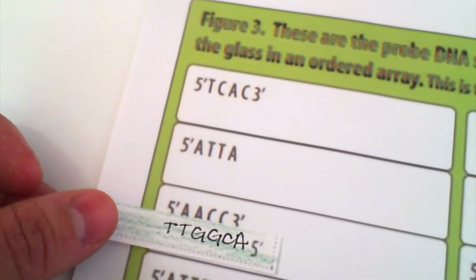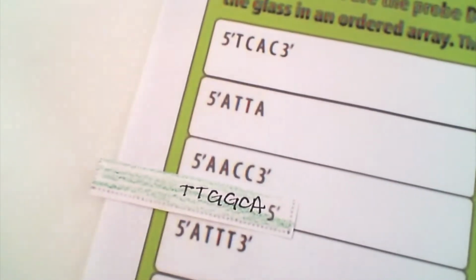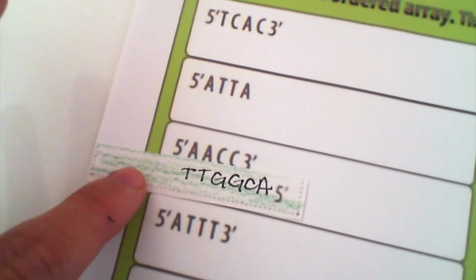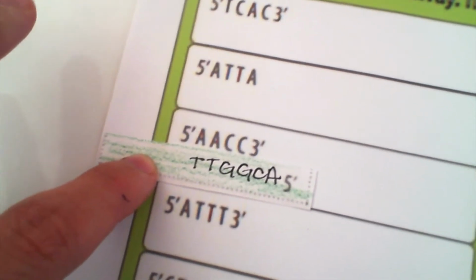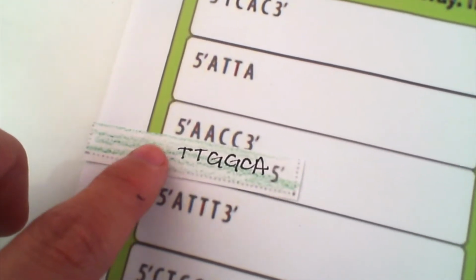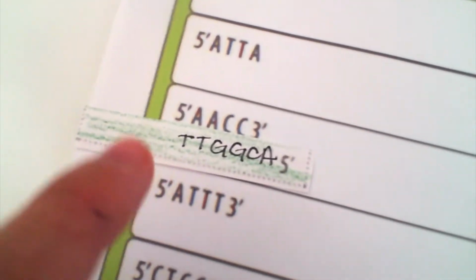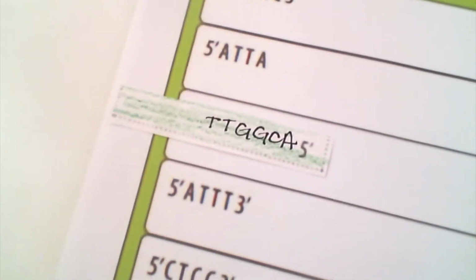Then down here, wait a minute. It looks like something might work. So A does go to T, A does go to T, C with G, and G with C. Even though we are not using the C and A in the complementary DNA, that's fine, because for this one, only 4 of them need to match up perfectly. And this one does. So for this gene, this cDNA is going to stick to this one. And it'll just sit there.